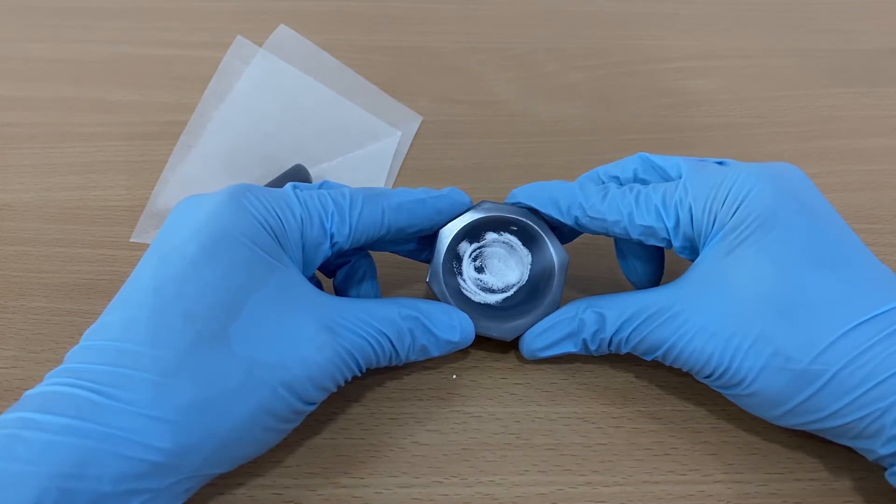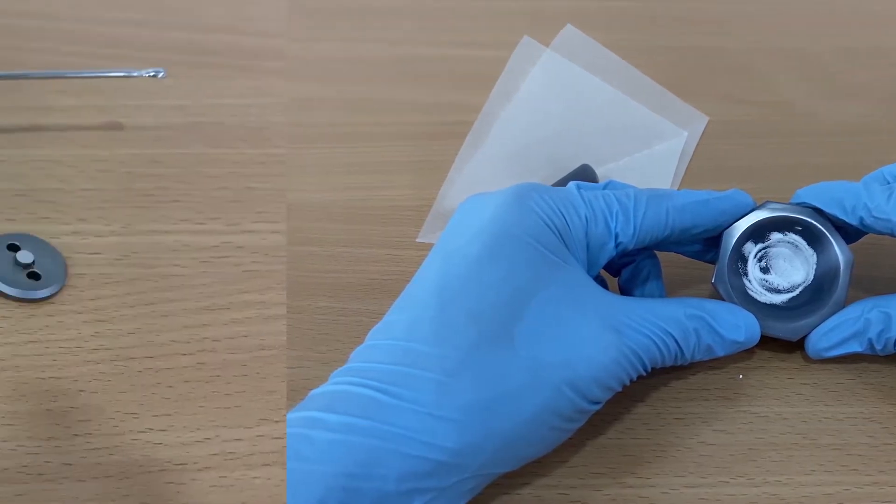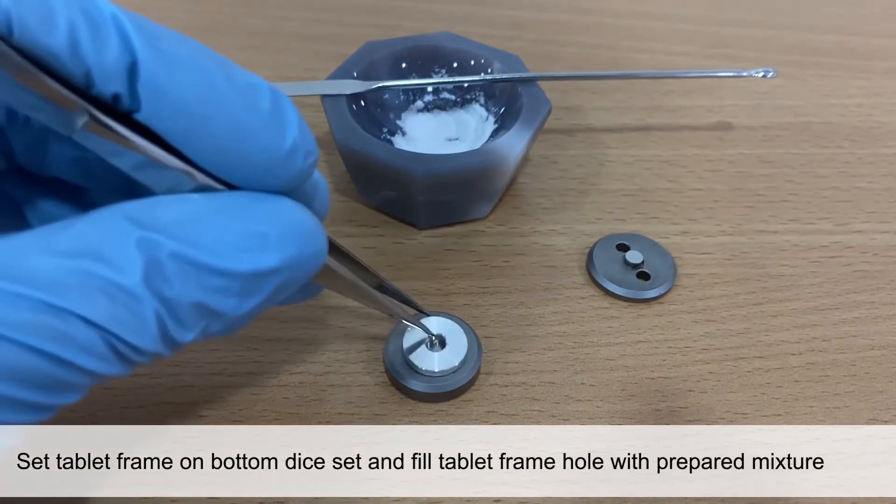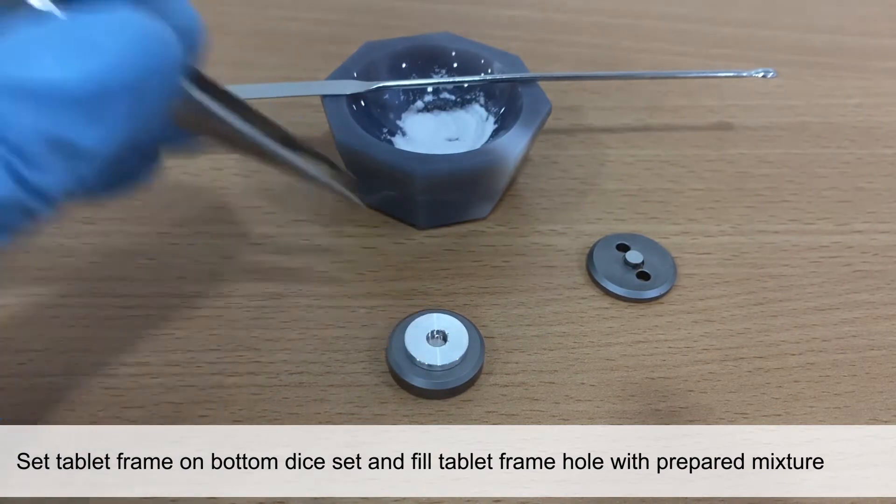Now, we move on to assembling the dice set. Set the tablet frame on the bottom dice set and fill in the tablet frame hole with the KBr and sample mixture.